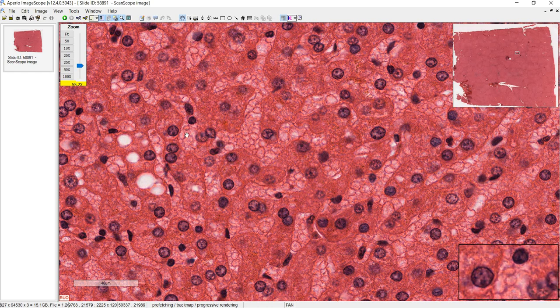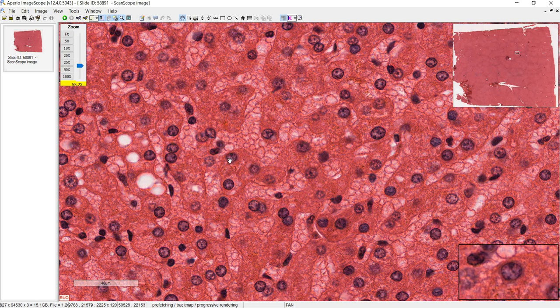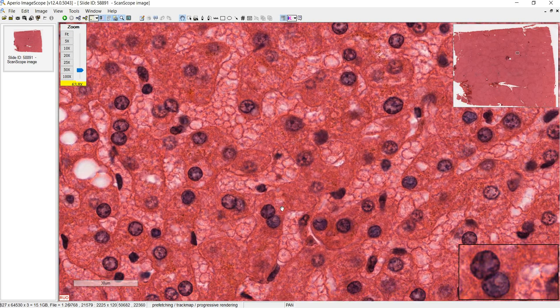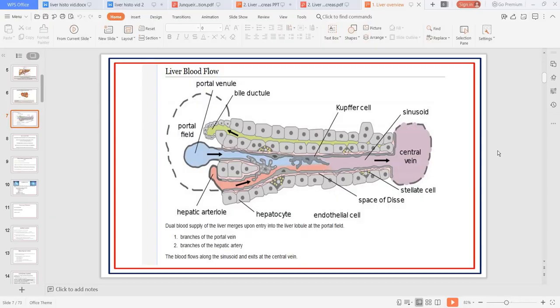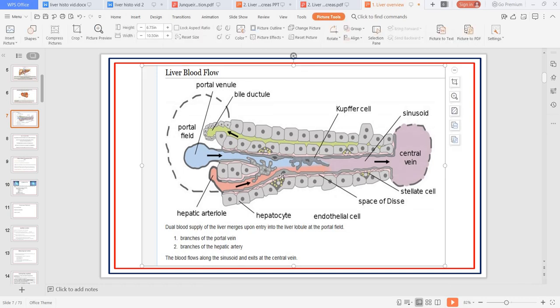The hepatocytes have nuclei that are very round and stain kind of lightly when it comes to basophilia. Sometimes on this slide it's hard to see, but you can see the border between two hepatocytes here. It's important to remember that these sinusoids are specialized capillaries with endothelial cells that are very leaky, so a lot of material can get through into the space just underneath the endothelial cell and between the endothelial cell and the hepatocytes. We also have stellate cells or cells of Ito within that space, and inside the sinusoids we have Kupffer cells, which are macrophages.